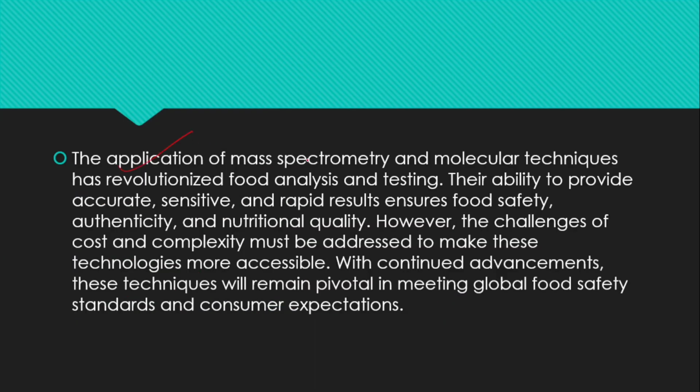The applications of mass spectrometry and molecular techniques have revolutionized food analysis and testing. Their ability to produce accurate, sensitive and rapid results ensures food safety, authenticity and nutritional quality. However, the challenges of cost and complexity must be addressed to make these technologies more accessible. With continued advancements, these techniques will remain pivotal in meeting global food safety standards and consumers' expectations.